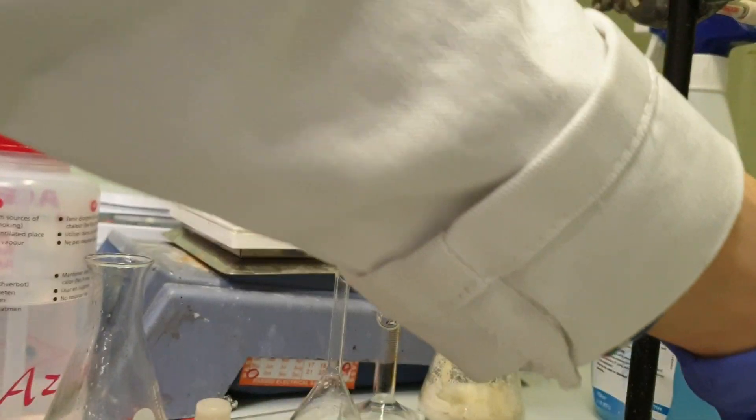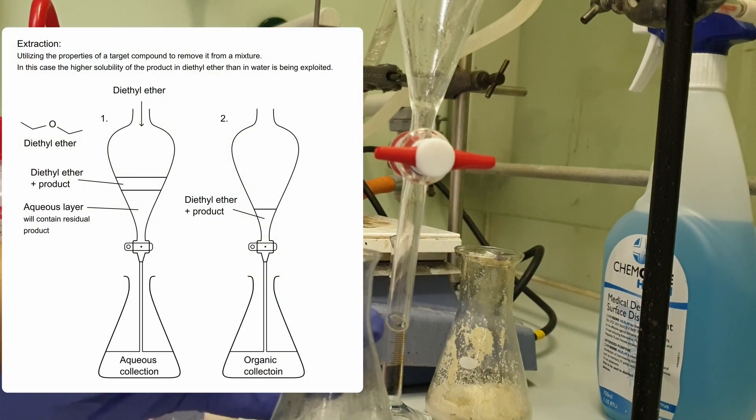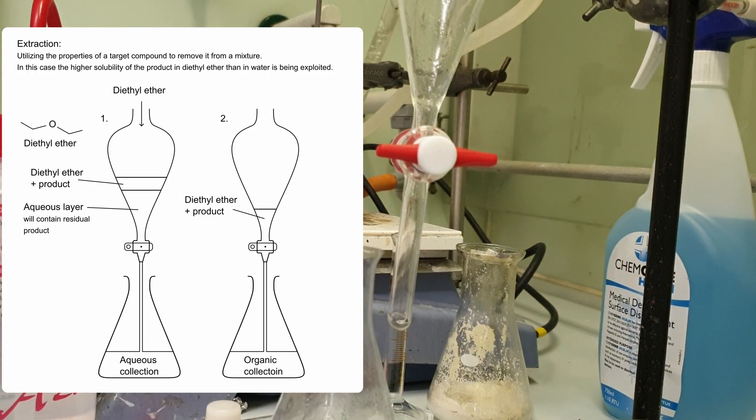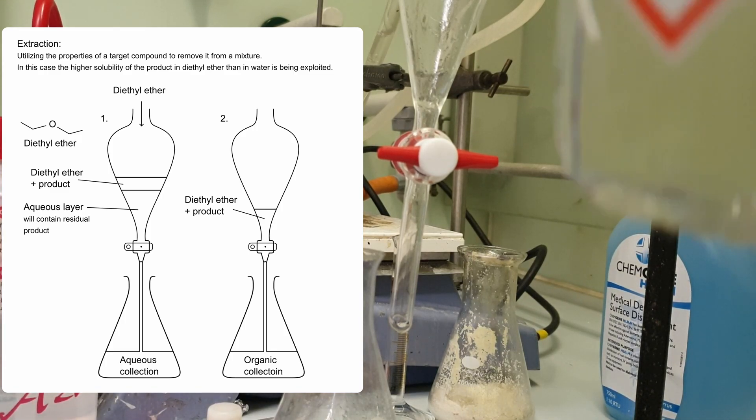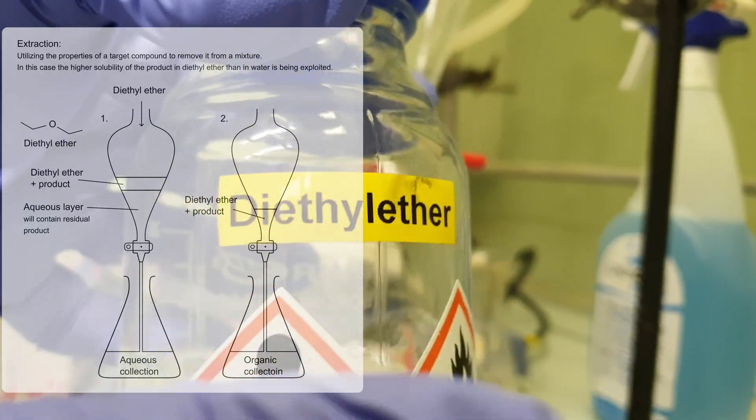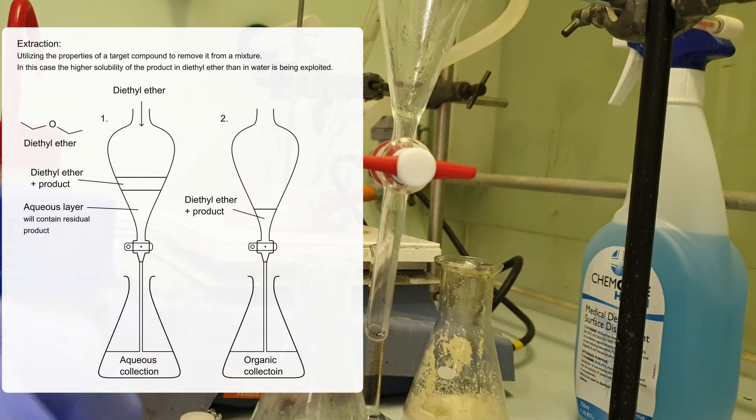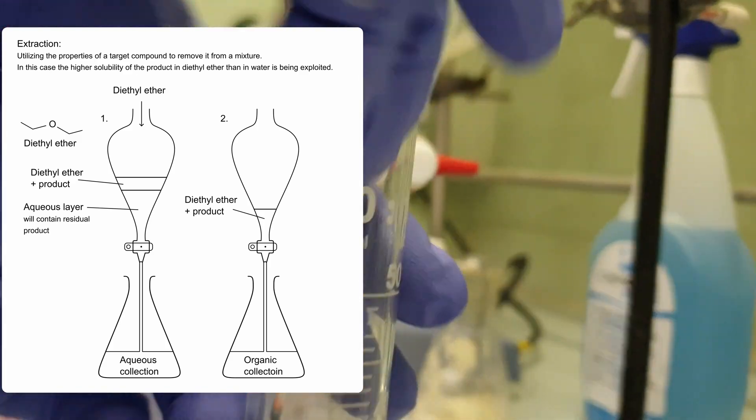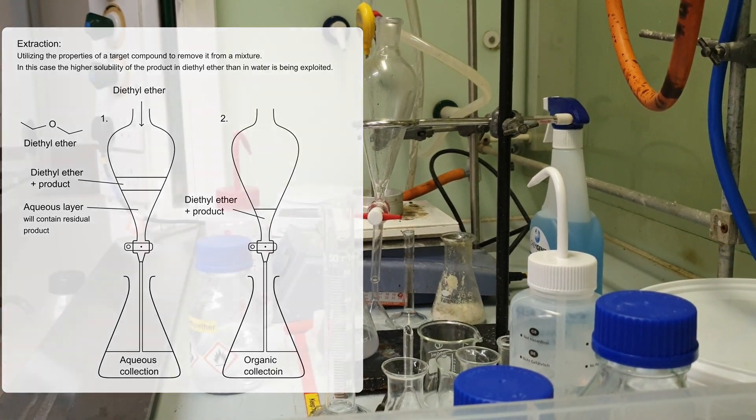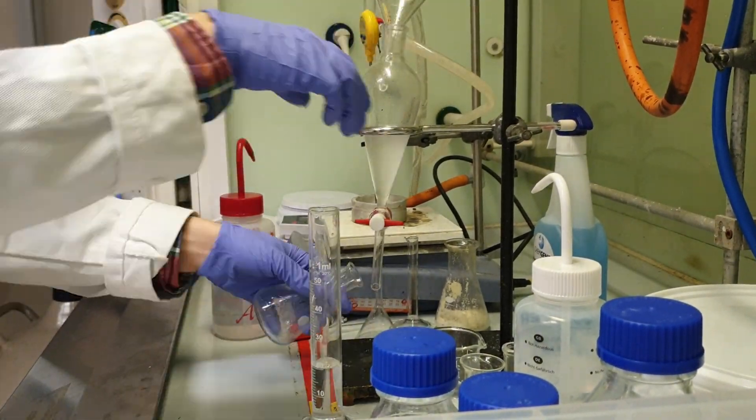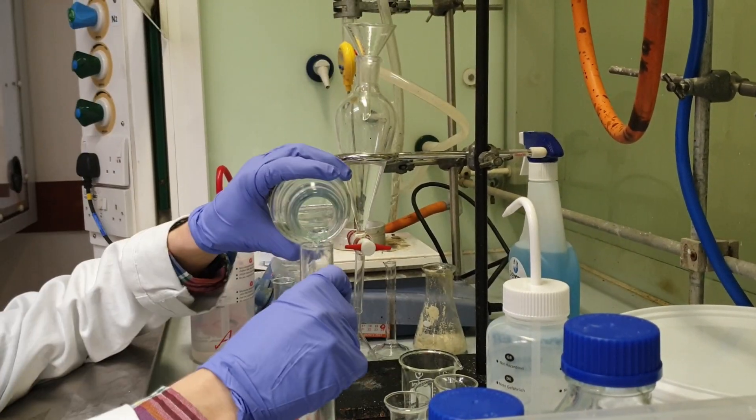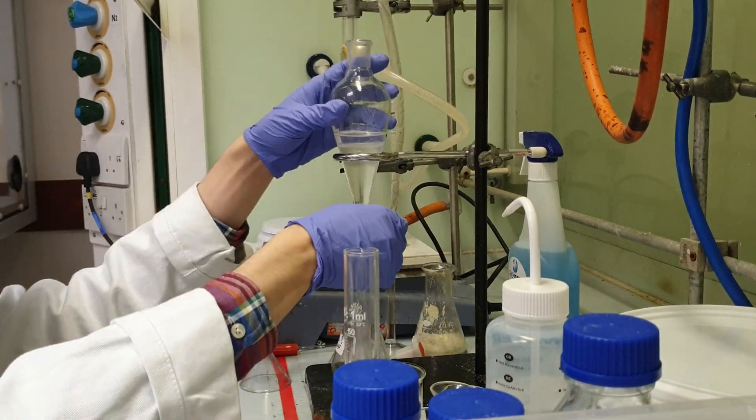I've got my first organic layer. I'm going to do some extraction on the aqueous layer and make sure I get all my product out of it. Basically my hexanol product is more soluble in ether than it is in water. So if I add ether to the aqueous layer I'll get two separate layers and quickly the ether layer will retain most of my product. I combined the aqueous layer with diethyl ether three times to get as much of my product out of the aqueous layer as possible.